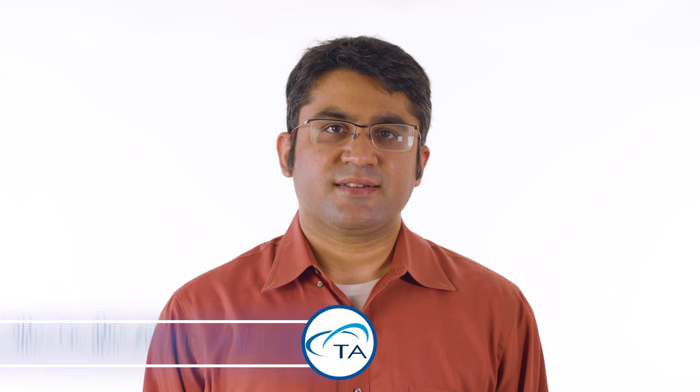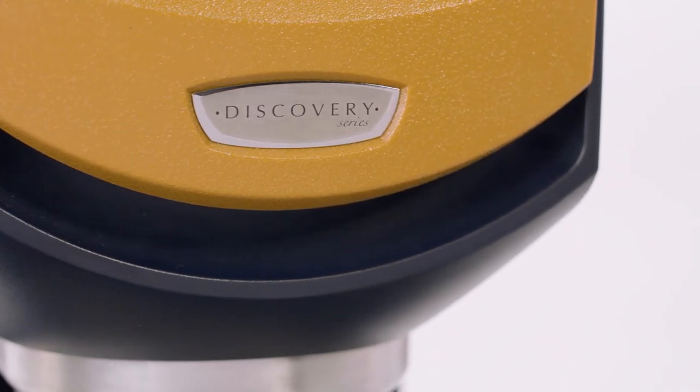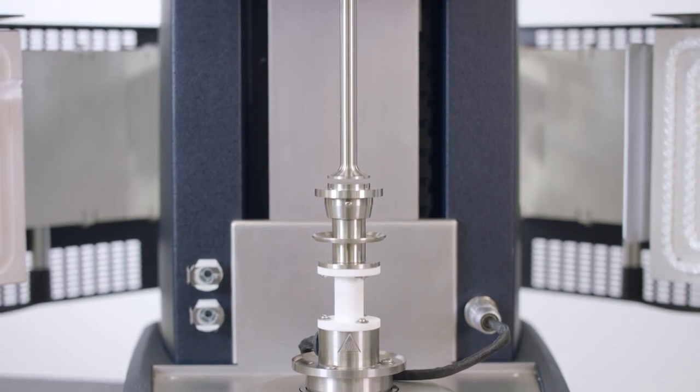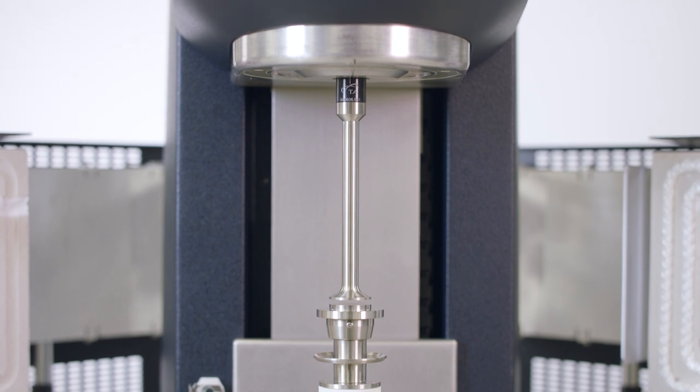Hello and welcome to another TA tech tip. In this tech tip we will show you how to load polymer pellets on the Discovery Hybrid Rheometer for running melt rheology experiments. The TA Instruments Discovery Hybrid Rheometers are commonly used to study the melt rheology of polymers. In this tech tip we will be using a 25 millimeter parallel plate setup with an ETC oven.